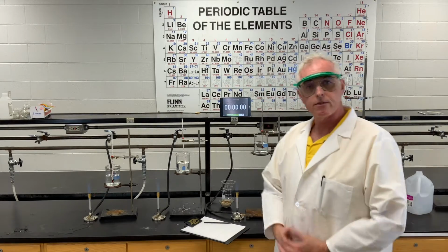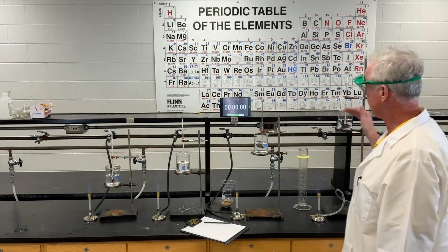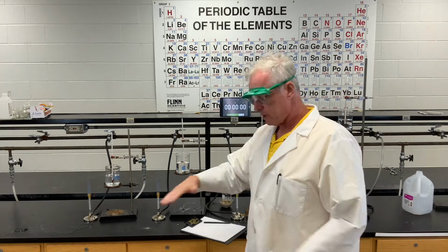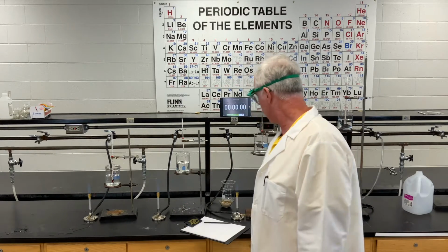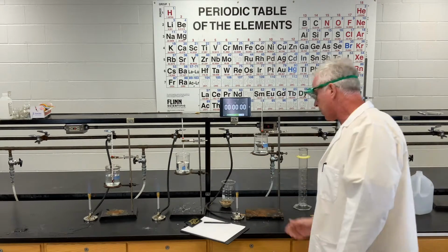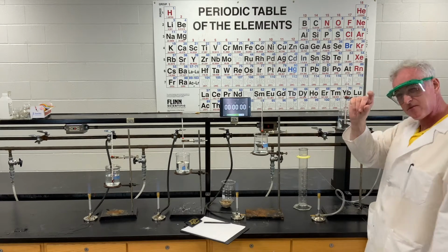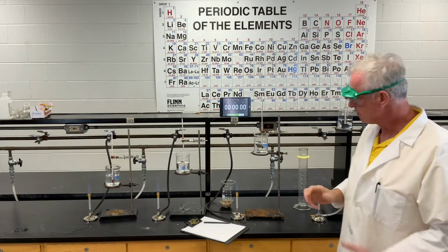Okay, so we're back in here for day 2 of the burner lab. As you can see, I've set up 4 ring stands, the 4 heights that we talked about yesterday. Really low at the bottom of the burner, right at the top of the inner flame, right at the top of the outer flame. And it's a little hard to see the outer flame, but it's right at the top. And this one's about this much above the top of the outer flame.